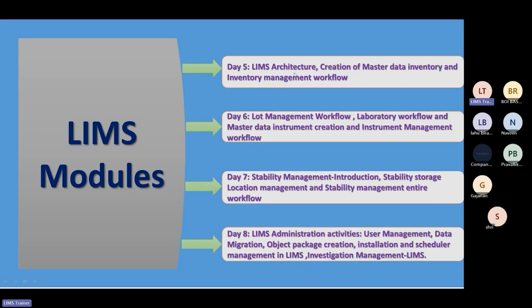Then the architecture. Then creation of master data inventory. Then lot management workflow. All the workflows will be included. Then laboratory workflow, master data, instrument creation. Then stability management will be there, and also some administration activities.